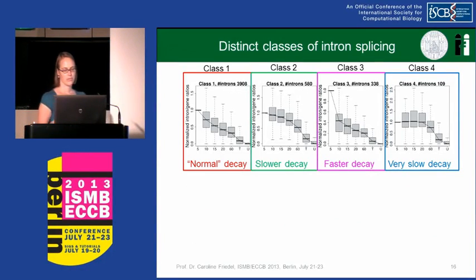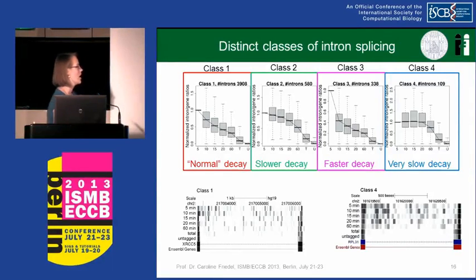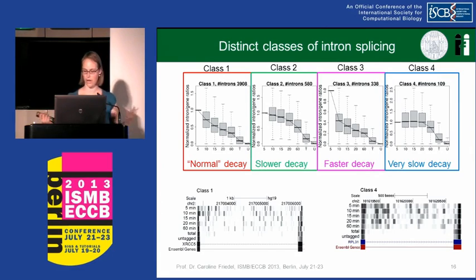So now I just want to give you an example of how this looks for individual introns. So here's an example for an intron of class 1. And you see that the number of reads, so the color and the bars indicate the number of reads, sort of decrease from 5 minutes to total and untagged RNA. So this is an example of class 4, where we actually see that these levels do not really decrease. And even at 60 minutes, we still have quite a lot of reads. But in total and untagged RNA, they're basically gone.